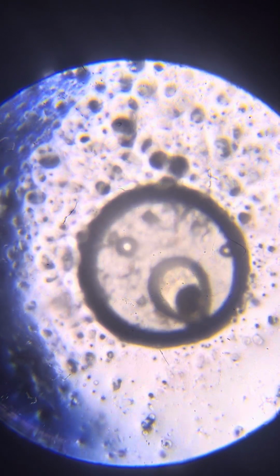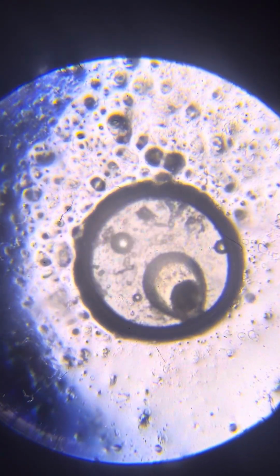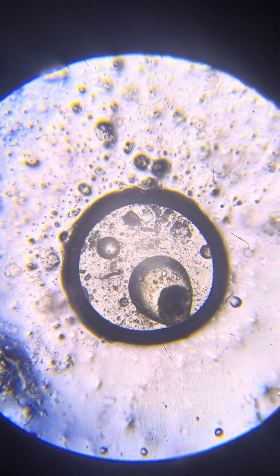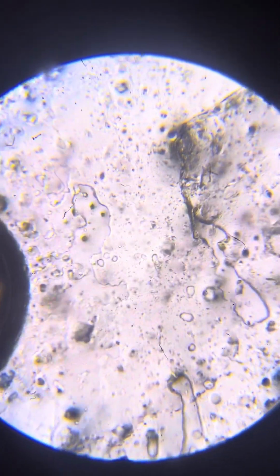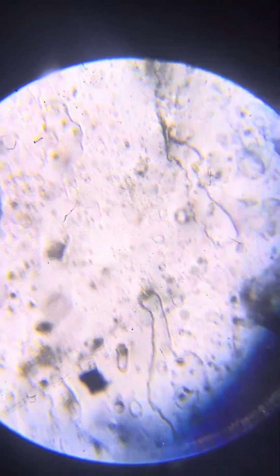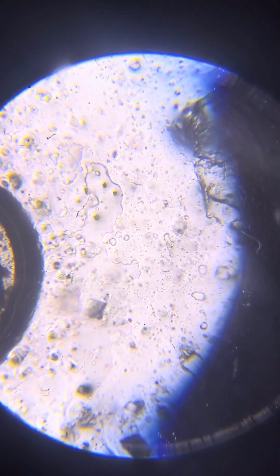But really a beauty, and it's so nice that you see the different change of focus outside and inside the Nero. This is a nice shot, really. Maybe for the thumbnail. And it seems that on the top we have another nice Nero, but I cannot pan there with the slide. It looks very nice actually, the one on the top.